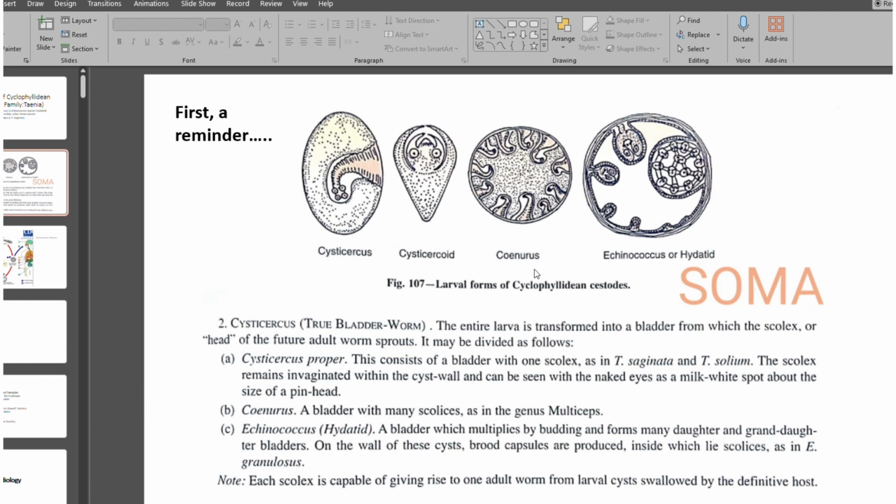However, the best I could find is that this looks like some kind of bladder worm. We used to call them bladder worms. It's an old-fashioned term, and this is an old resource. It's oval like Cysticercus, but it's got multiple worm heads like this one, and it doesn't really fit the picture for either one. It's like a combination of these two. And these would be in the family of Taeniidae.